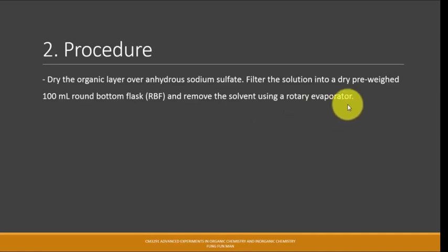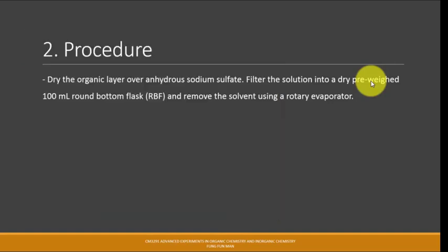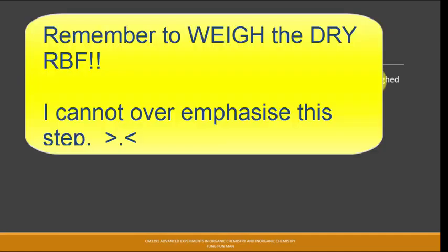Many students always forget to pre-weigh it, so they added it, forgot to weigh, and then trouble. They need to wash everything up first, wait for it to dry in the oven. It takes them an extra 1.5 hours. They're gonna have a bad day. Don't. Please always weigh your dry RBF. Put it on a marker, on your lab manual, on anywhere. Okay, can write on your hand, on your glove. Please just record it down.